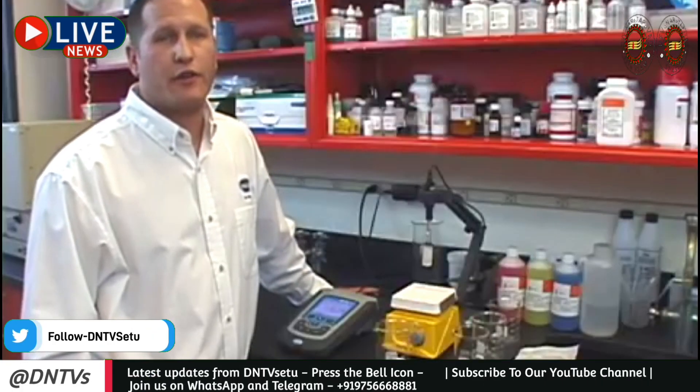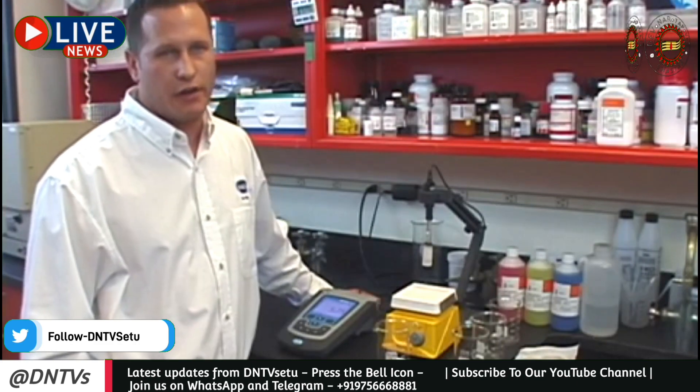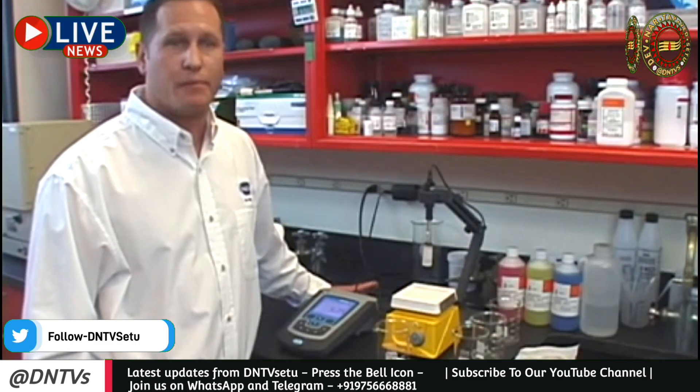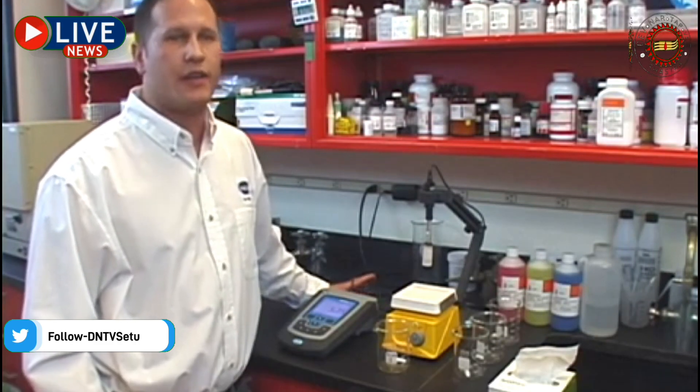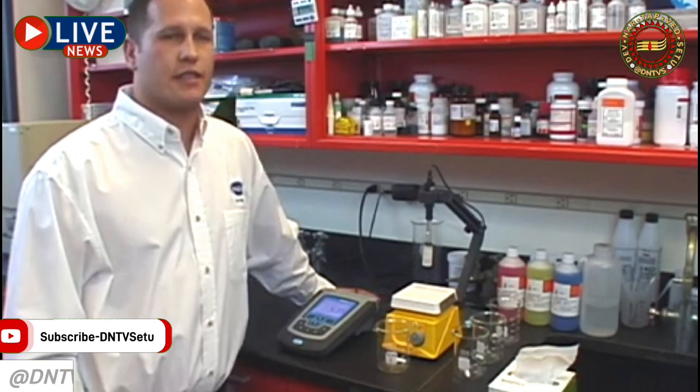We typically find that inaccurate measurements are not due to one significant issue, but a combination of smaller errors. Now that you have learned a little bit about how to properly calibrate, take measurements, and store your pH electrode, our hope is that you can increase the accuracy and precision of your pH testing and make the most of your measurement system. To learn more, please visit www.hawk.com.